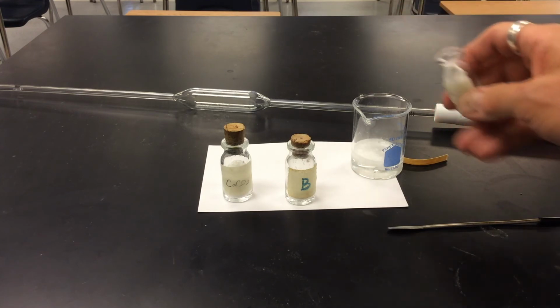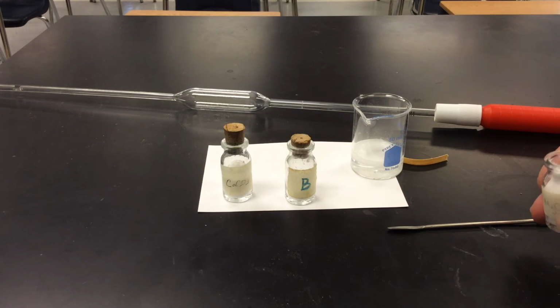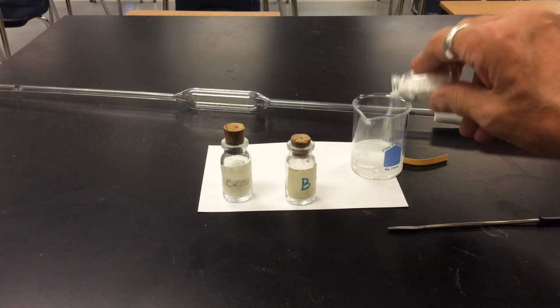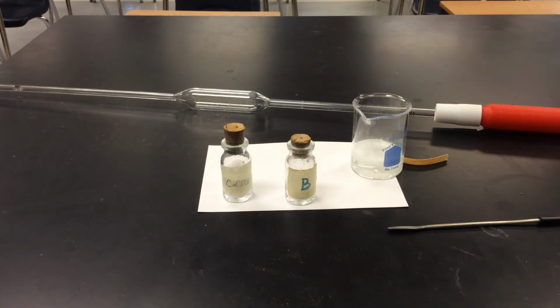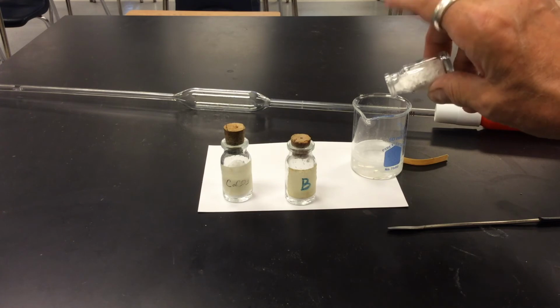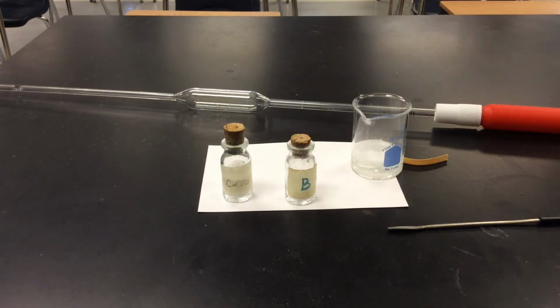I like the fact that many of them will be very precise with their measurement, but that also compromises the time factor. So if you want them to work fast, then the precision is probably going to be less, and that's fine. This lab does not involve any indicators. It doesn't involve any pH measurement. We just go for the reaction until all of the acid has reacted. Remeasure the mass of the container.